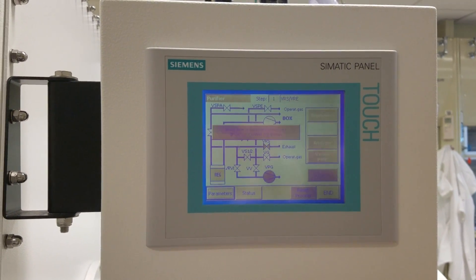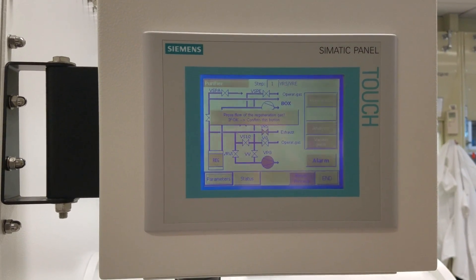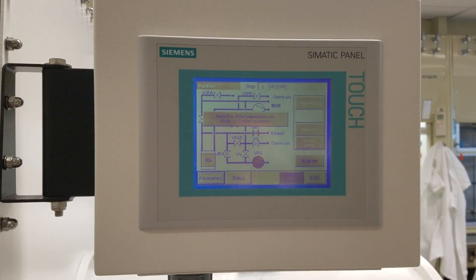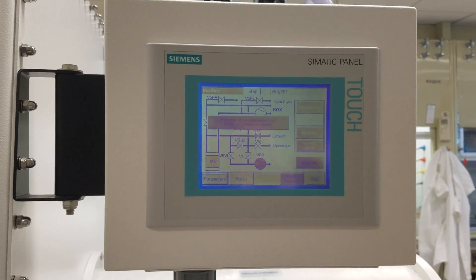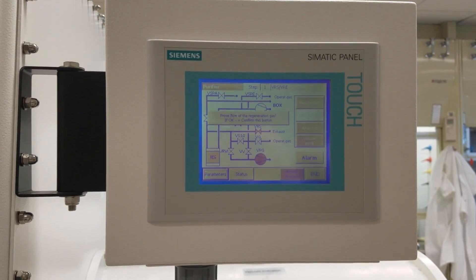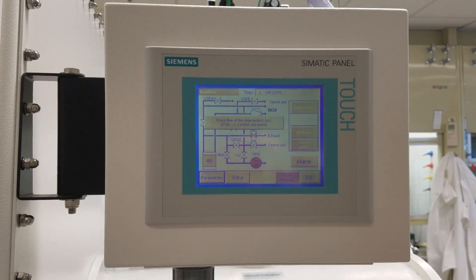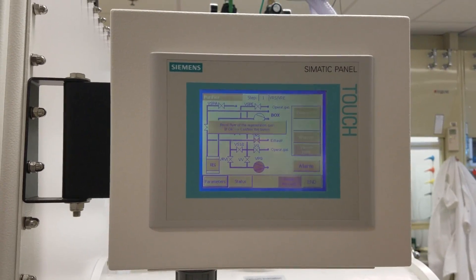And it'll ask you to prove flow of the regeneration gas. At this point, the only way to get out of the regeneration window is to click reset process. Let someone know in the lab if you do that, because the reset process still shuts everything down for about 20 minutes or so, and if it's unnecessary, then just by asking us, you can avoid that.